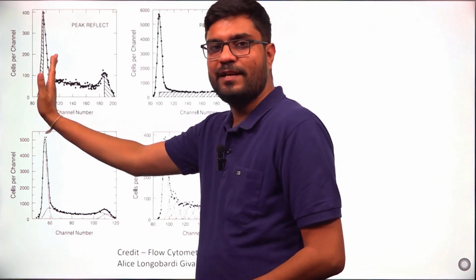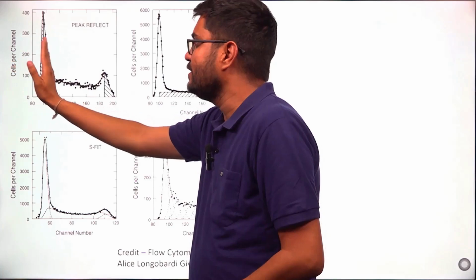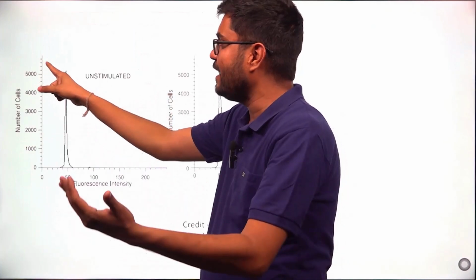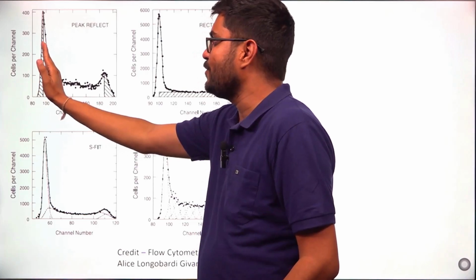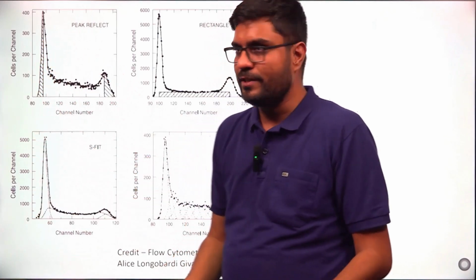So the model is calculating the mode of G1 phase, and calculating the area on the left side of that mode line. So the central line is for the mode and we are having the area left. Then the system is making a mirror image of this left area towards the right also. So we are having this left, the similar amount will be selected on the right, and then the area under the curve will be calculated.